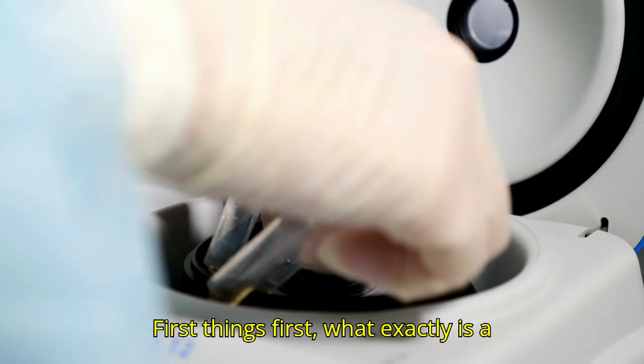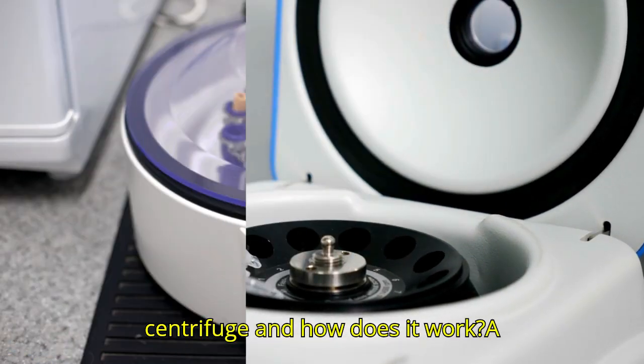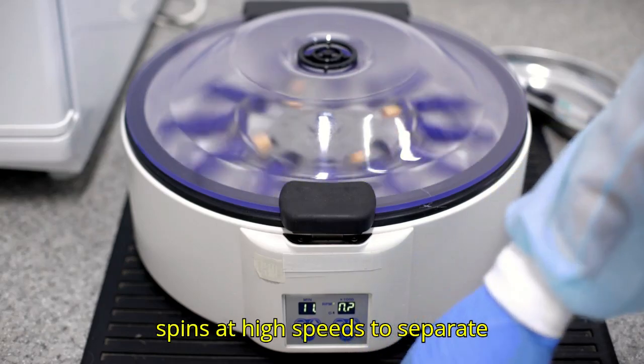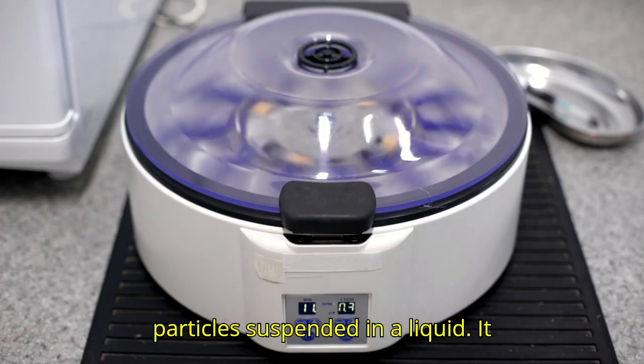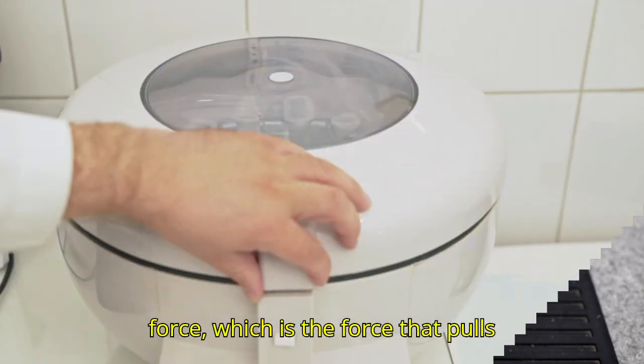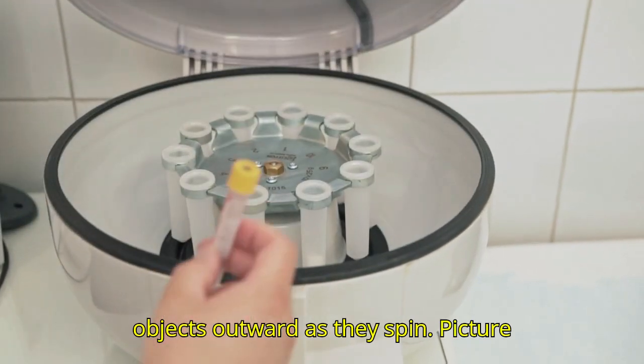First things first, what exactly is a centrifuge and how does it work? A centrifuge is a laboratory device that spins at high speeds to separate particles suspended in a liquid. It operates on the principle of centrifugal force, which is the force that pulls objects outward as they spin.